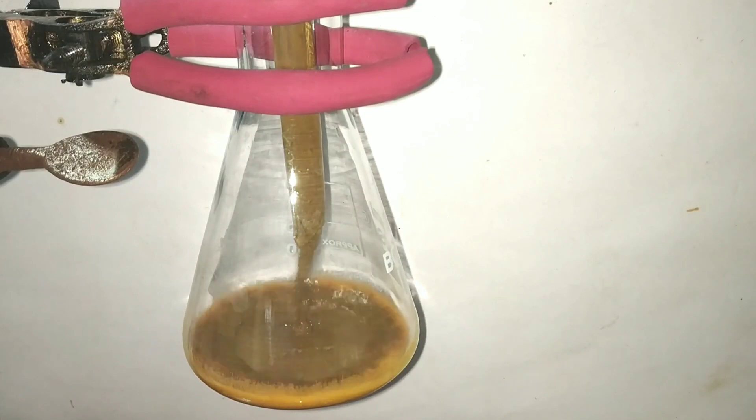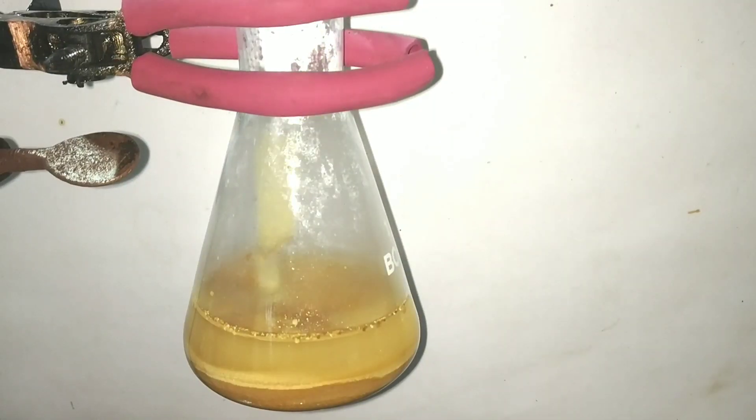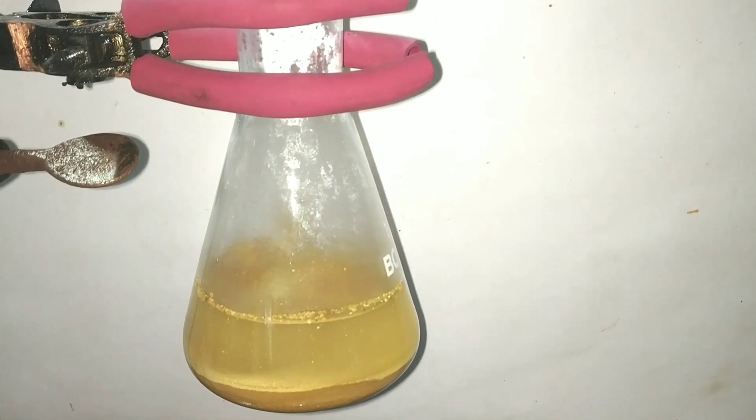I had to transfer everything into a bigger container since that small round bottom flask was not having enough space to hold the volume of mercury oxides. Later when I added the rest of the sodium hydroxide, the beautiful precipitate of mercury 2 oxide formed.